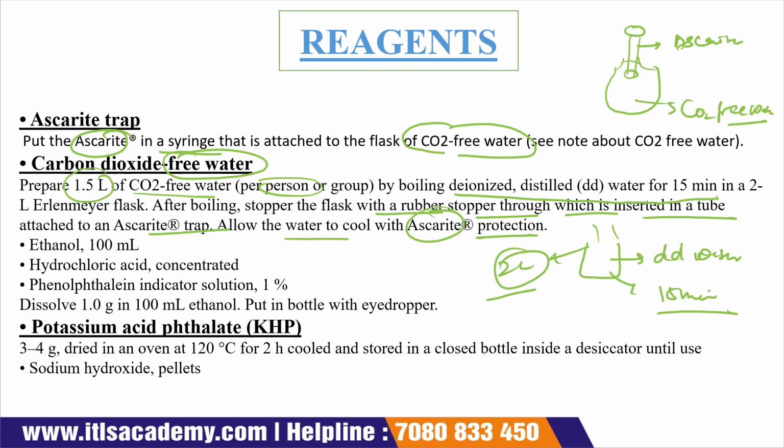We require 100 ml of ethanol. If it is not written how much percent of ethanol we require, we require 99.9% ethanol. We require hydrochloric acid, and the hydrochloric acid will be in concentrated form.